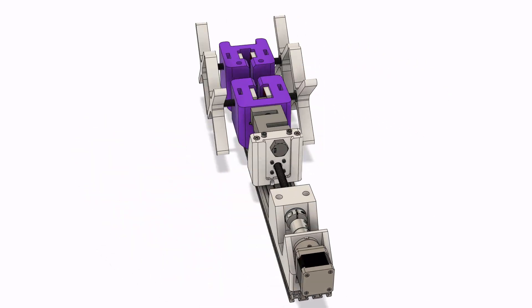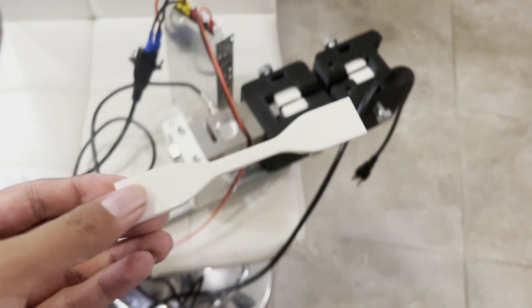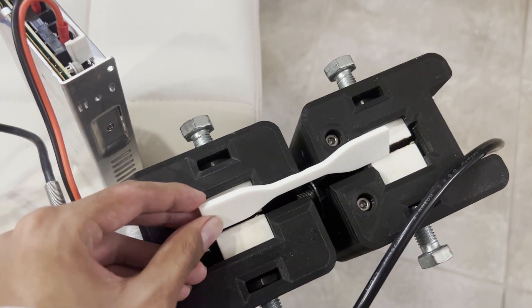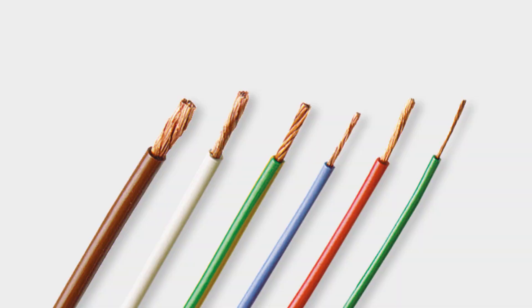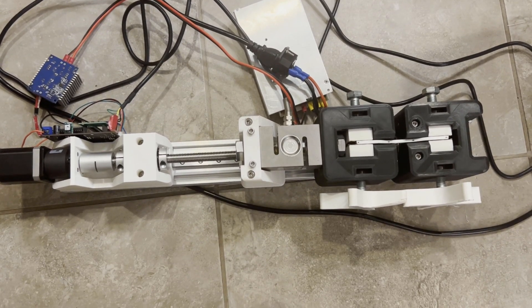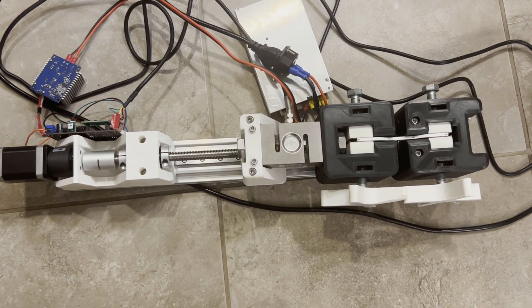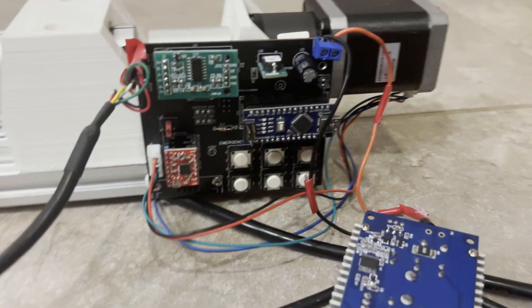Enter the low-cost tensile tester, which only costs $300 — a 50-fold decrease in price. It can test the strength of plastic, fabric, wires, crimp terminals, and much more. This machine provides an effective solution for material testing in low-budget situations such as startup companies, high schools, and undergraduate labs.